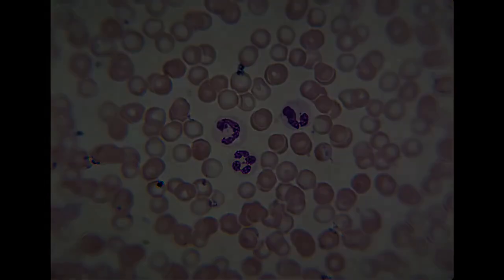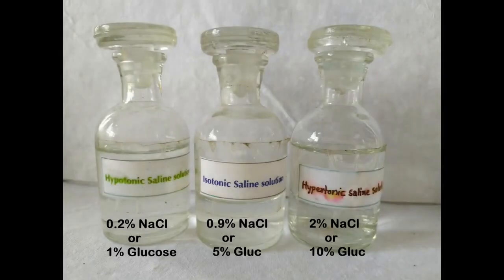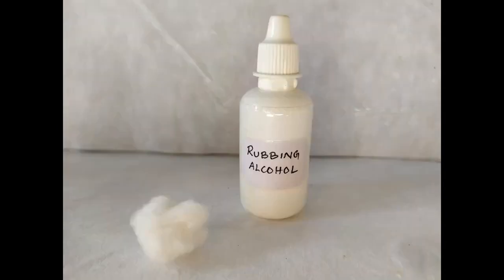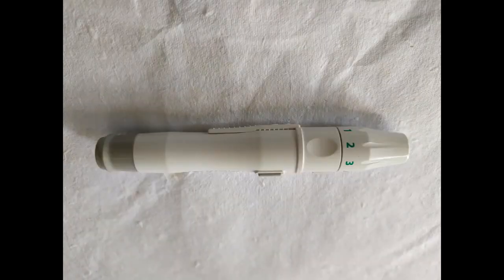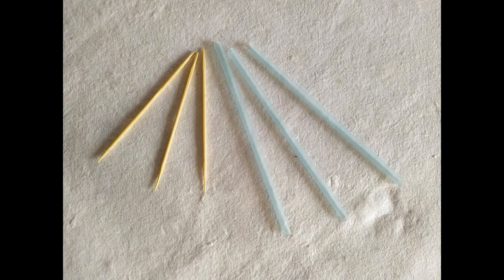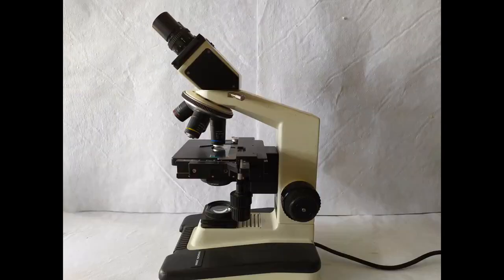For this experiment, we'll need the following: hypo, iso, and hypertonic solution of either sodium chloride or glucose, glass slides and cover slips, cotton and rubbing alcohol, a pricking device or a blood lancet, 3 droppers, 3 mixing sticks or toothpicks, a compound light microscope.